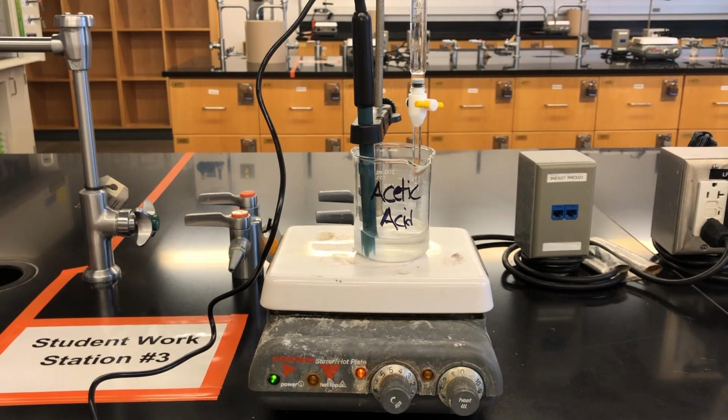After this, we clean up, remove the pH probe, and discard the reaction mixture into the waste beaker before moving on to Part D.